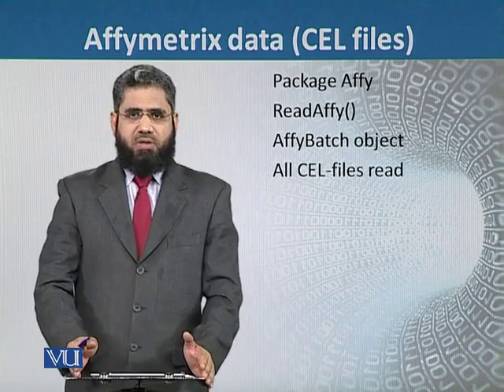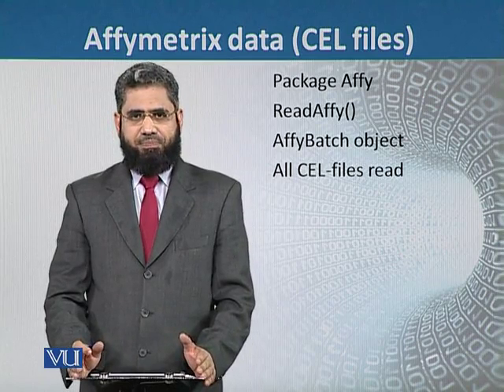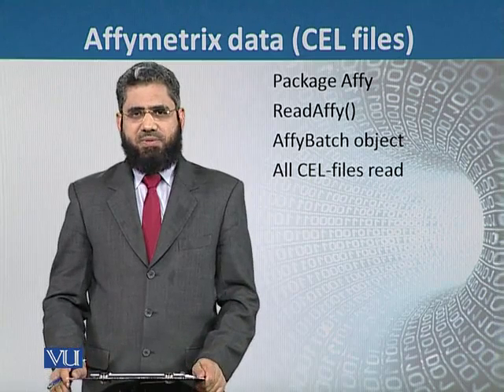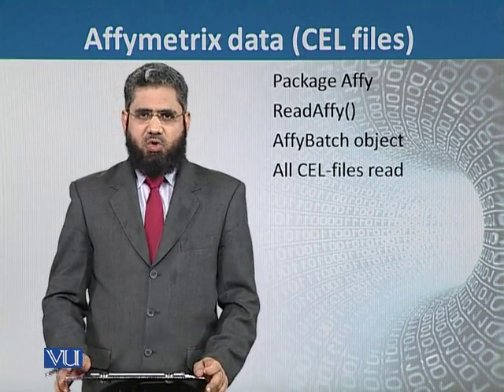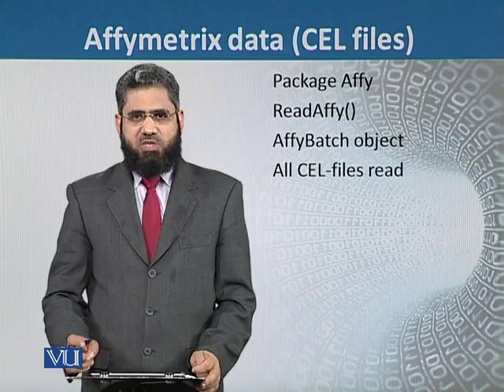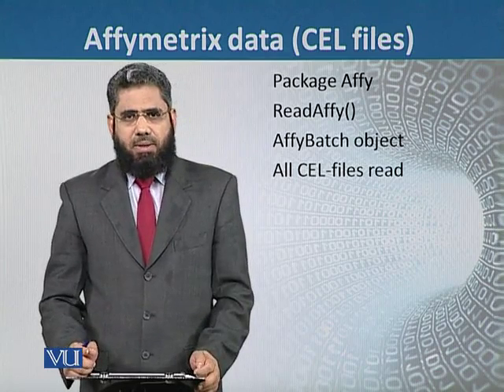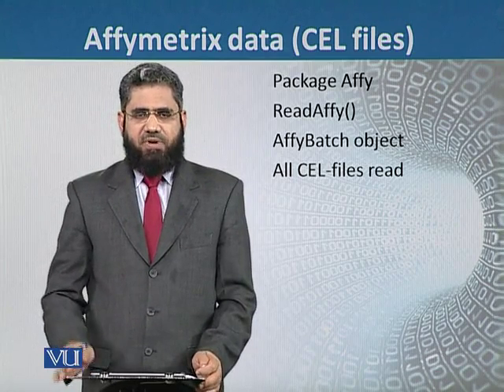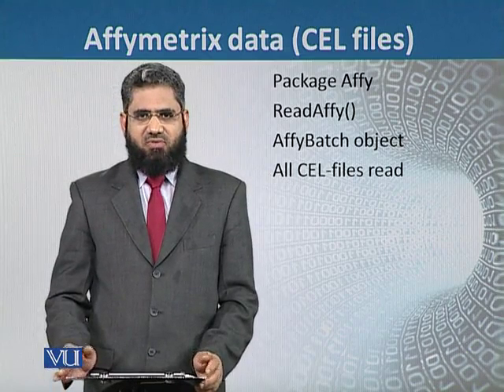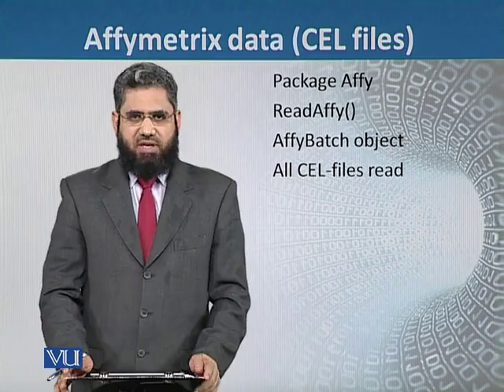Probes are small oligonucleotides, and each gene has at least one probe. So if humans have 40,000 genes, then we have 40,000 probes that are already attached to a solid support, generally a small glass slide. There is a small spot representing one probe, and they are present in triplicate. Then gene 2 has a probe, which is also present in triplicate on the glass slide.